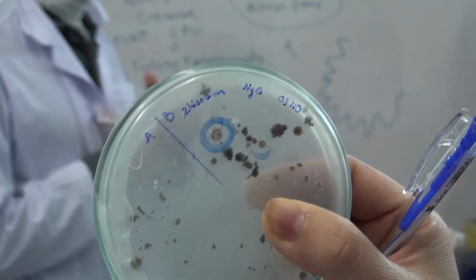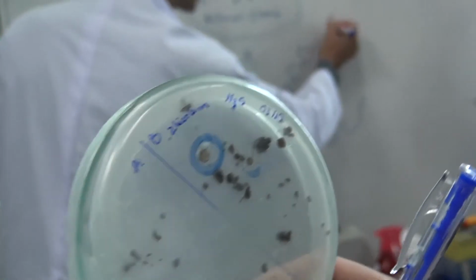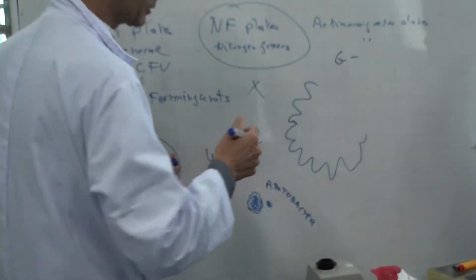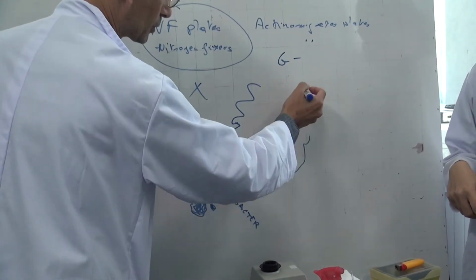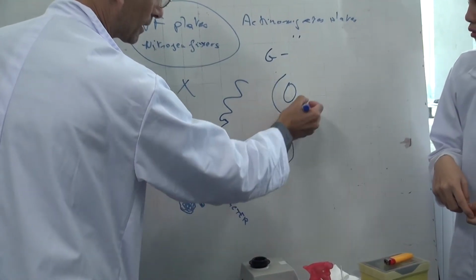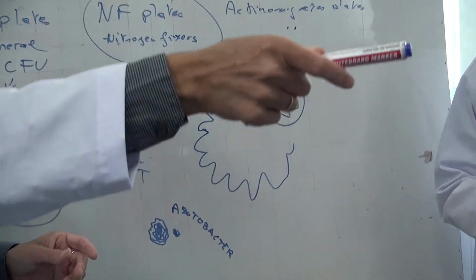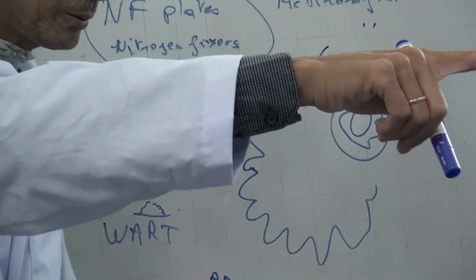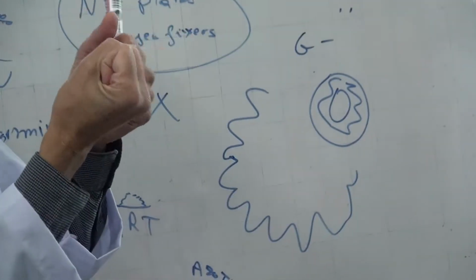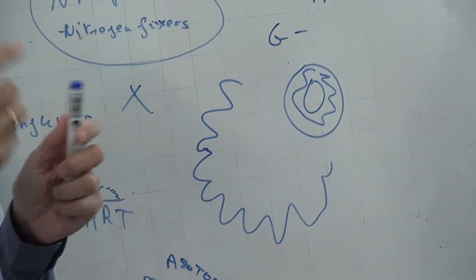If you take them under the microscope, they are gram-negative. And often, the ones with fixed nitrogen, they come with a thick polysaccharide around them. That's what you're seeing. You see that what is probably Azotobacter seems to be slimy. Slimy. Okay? You can tell them.